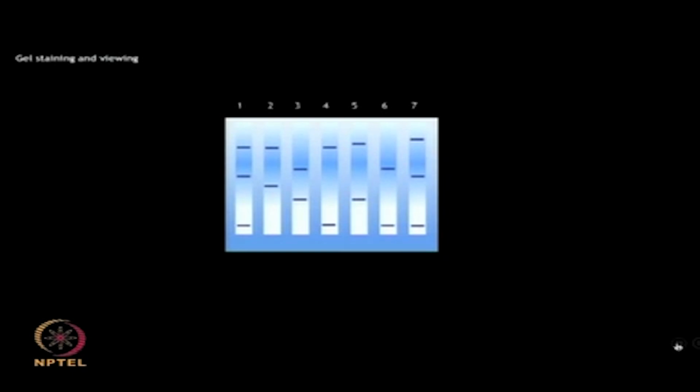The gel can then be stained with Coomassie brilliant blue and viewed to observe various discrete protein bands. After watching this animation, I hope you are able to understand how to perform native polyacrylamide electrophoresis, and these concepts can be applied for using the 2DE as well.